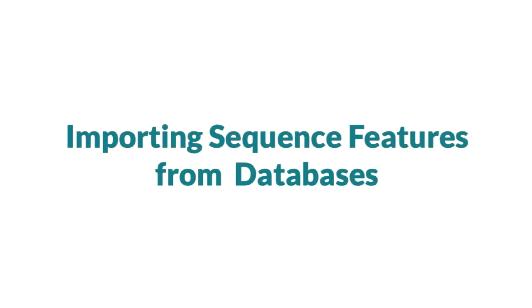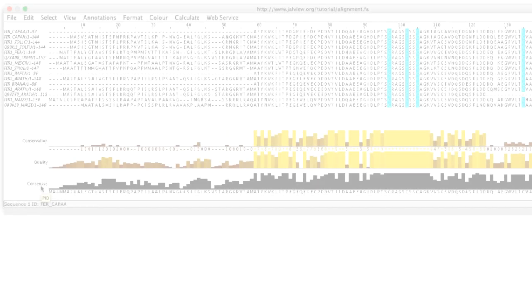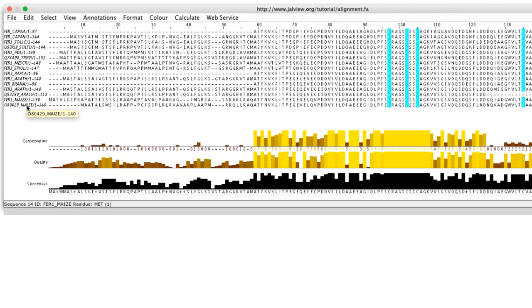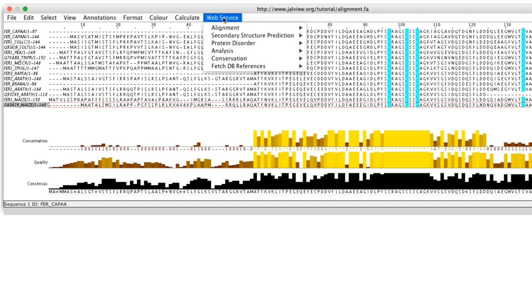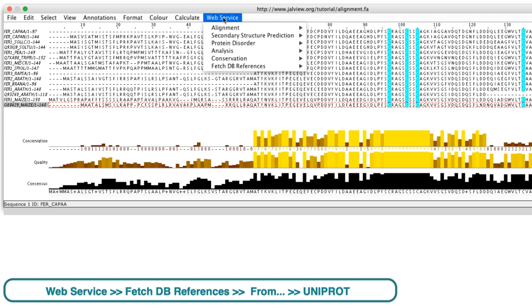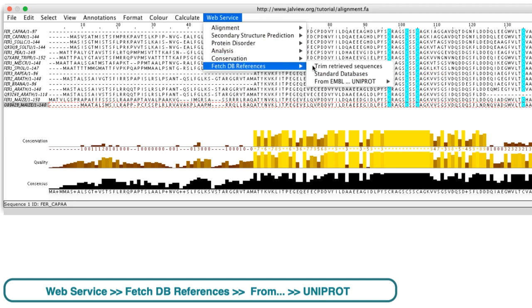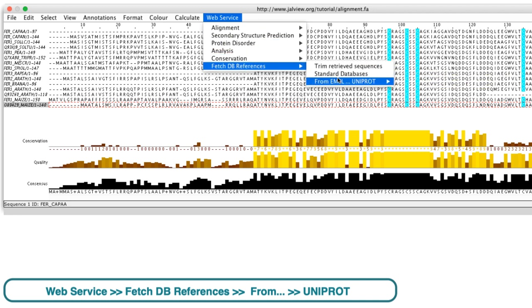Jalview can retrieve features directly from databases such as Uniprot and EMBL. I can retrieve features for a single sequence from a single database such as Uniprot. By selecting the sequence, go to the web drop down menu in the alignment window and select fetch DB references, then specify the database.